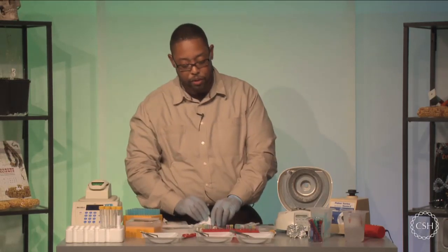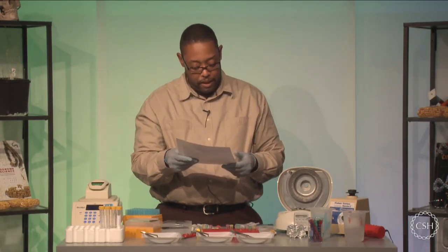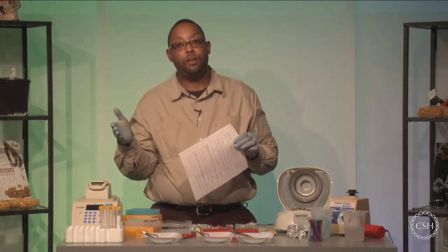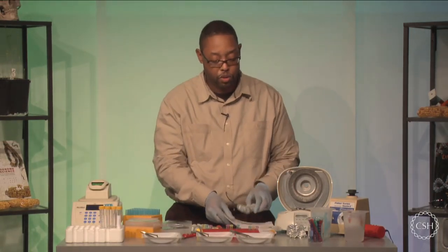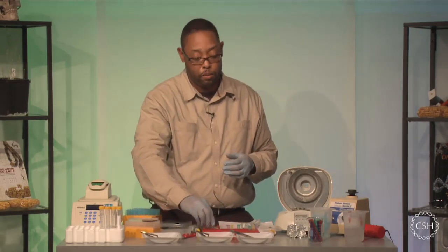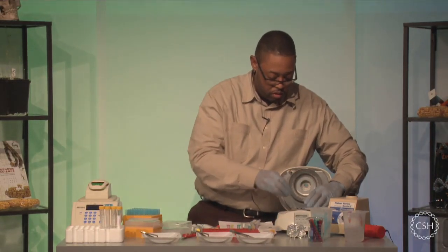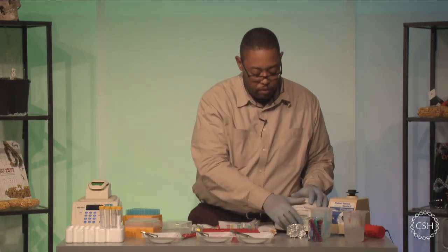At this point, you want to make sure that you check every portion of your protocol that you've physically covered, towards the very end. You can move on with the extraction here, or you can incubate your test tube for about another 5 minutes at 57 degrees Celsius to ensure that you've eluted the majority of the DNA. Typically, I don't have to do that. So what I'm going to do now is take my test tube that I've eluted the DNA from and put that into my microcentrifuge and give one last spin.